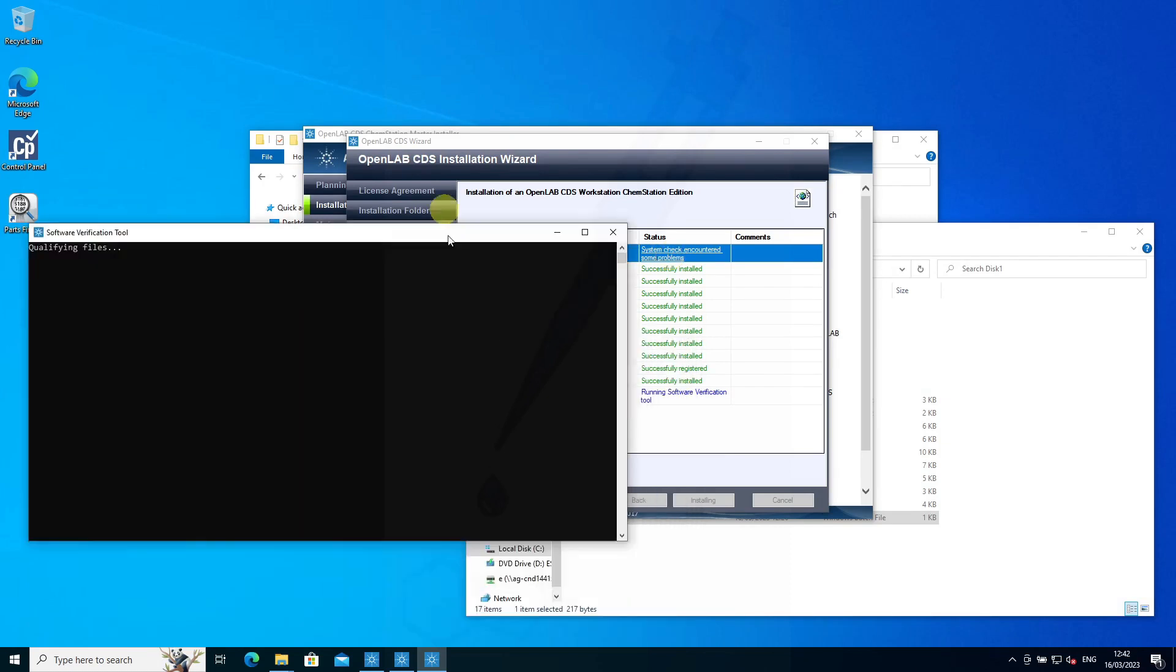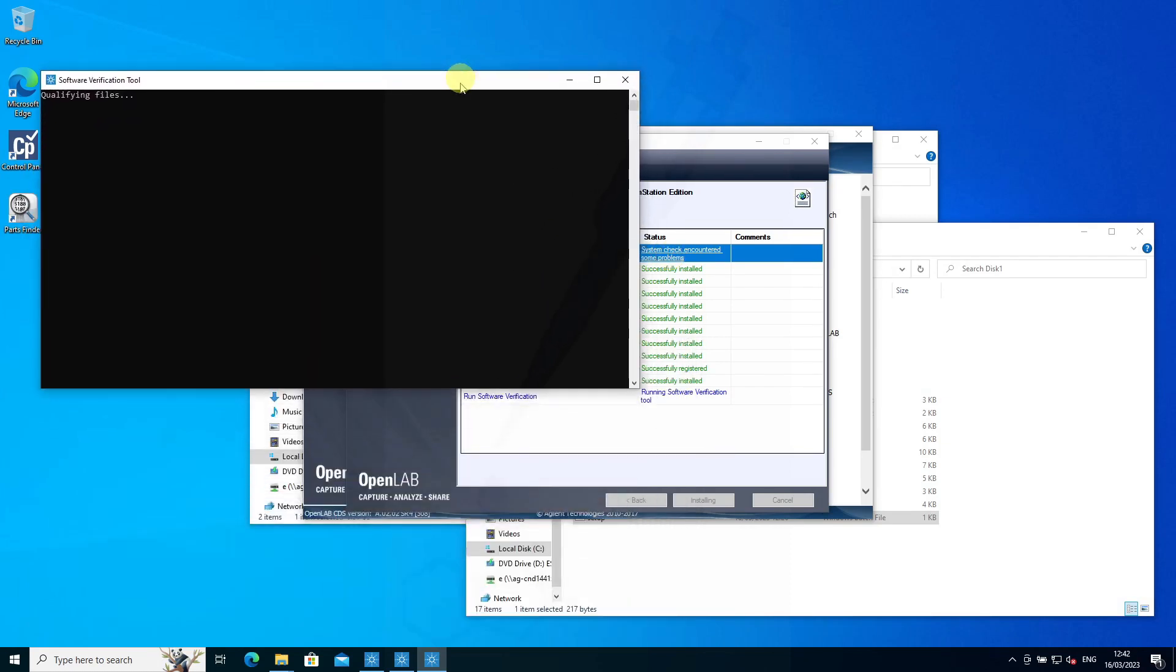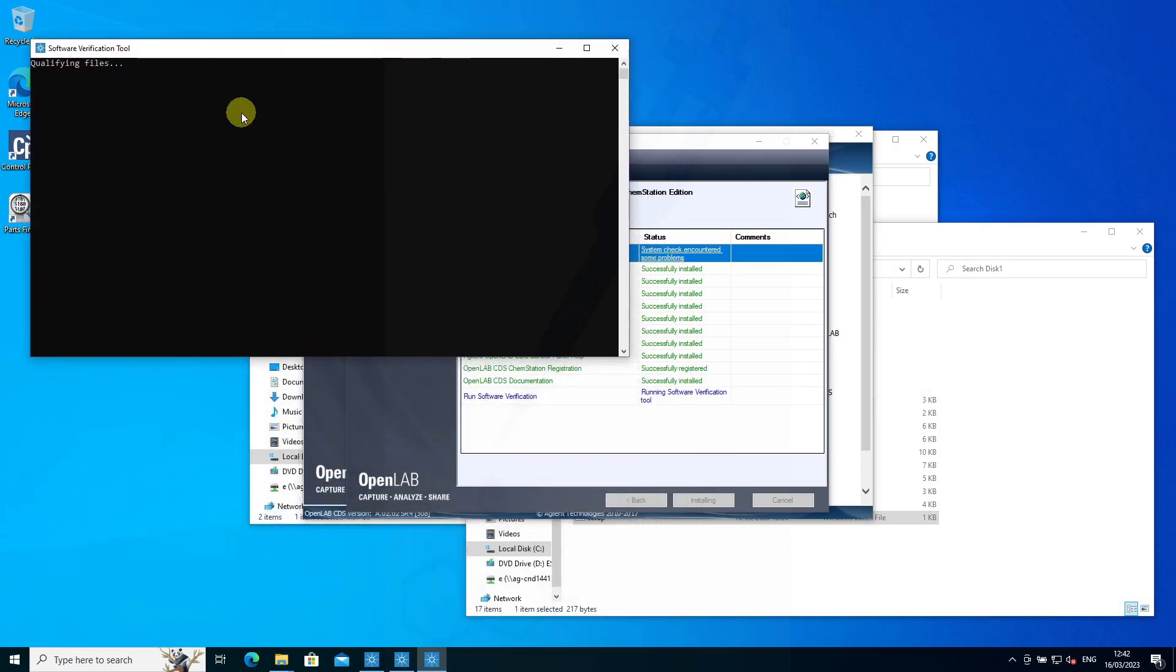After the install has happened, you'll see the software verification tool running, which should give you a report of the installation outcome.